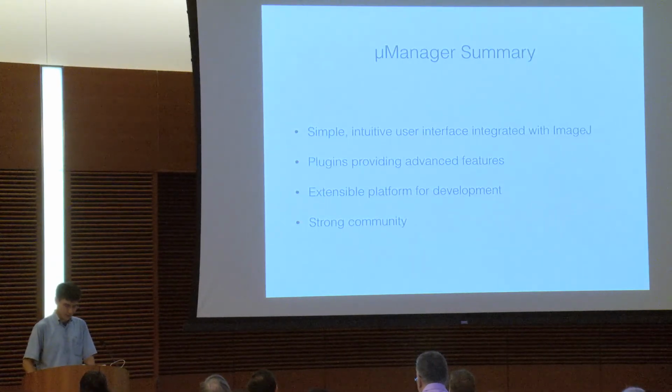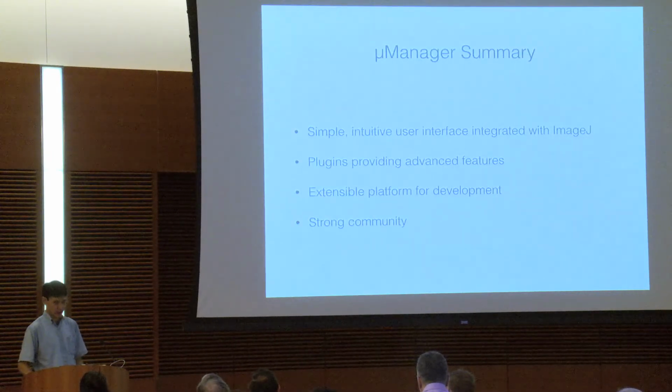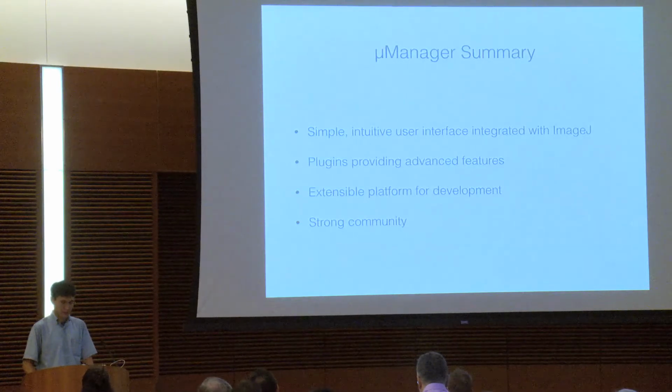We have a lot of capabilities for extending µManager if you're a programmer or if you can write scripts. And we have a very strong community, and we're very happy about that. It would never have been possible for a small team to maintain, let alone write, a program that can control thousands of devices. So that's, I think, a very big success. And we want that to continue.